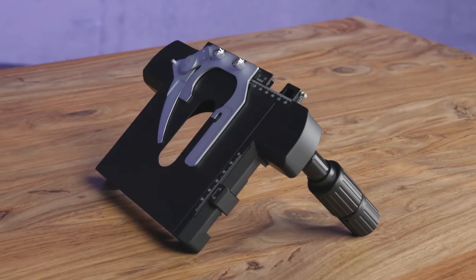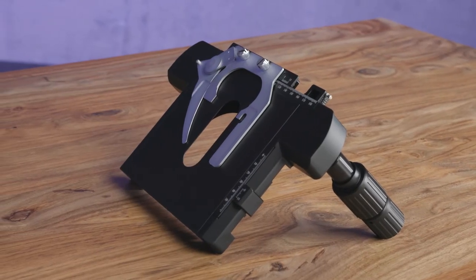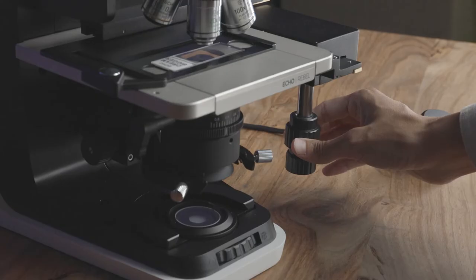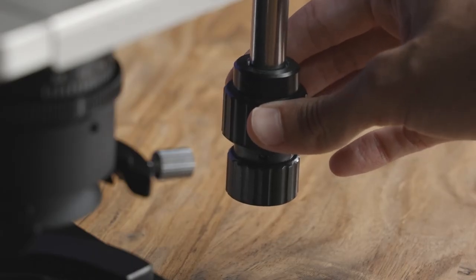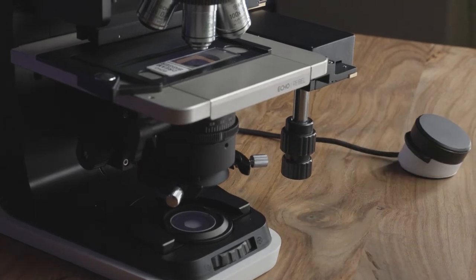The Clinical XY stage has a stage clip for glass slides and can only be used for upright applications. And the Attachable Mechanical XY stage uses inserts and can be used for well plates, petri dishes, hemocytometers, and even glass slides.